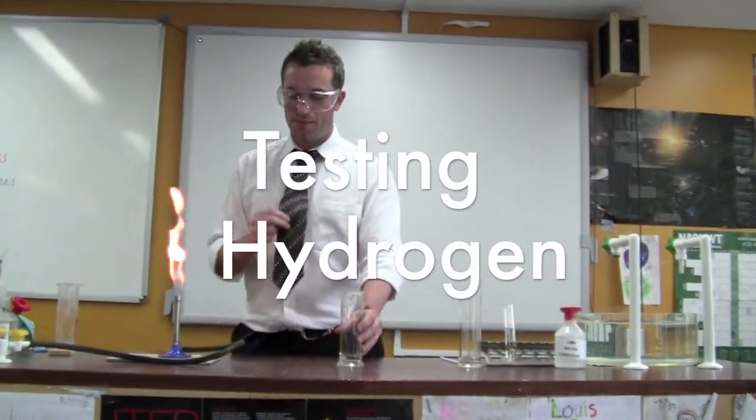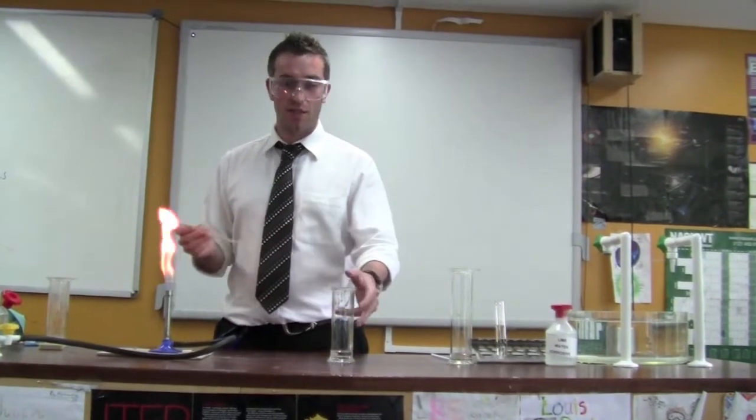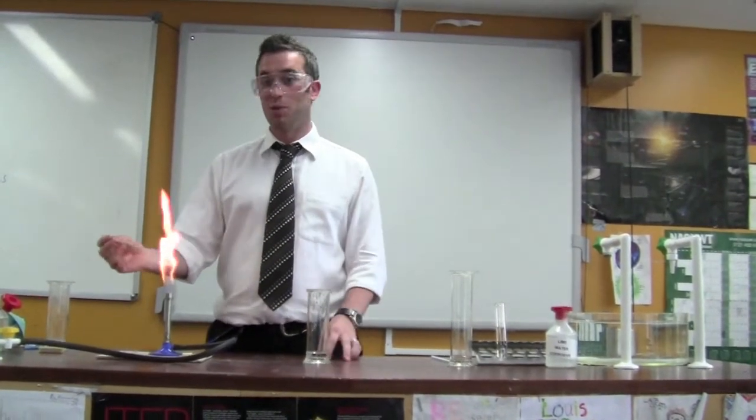Test for hydrogen. Again you'll need a Bunsen burner and splint. When we put this in it should make a noise — a squeaky pop. This is often called the squeaky pop test.